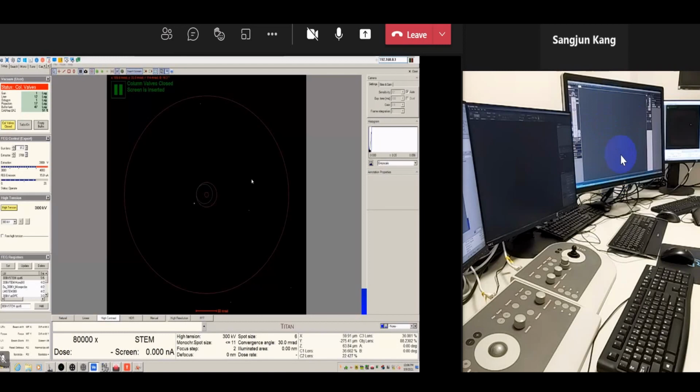I try to use this monitor as much as possible because it gives you more detail and higher resolution, but sometimes I need to use this monitor too. I thought it would be quite good to see both screens simultaneously. That's why I use these tricks. A little explanation will be helpful for the setup.